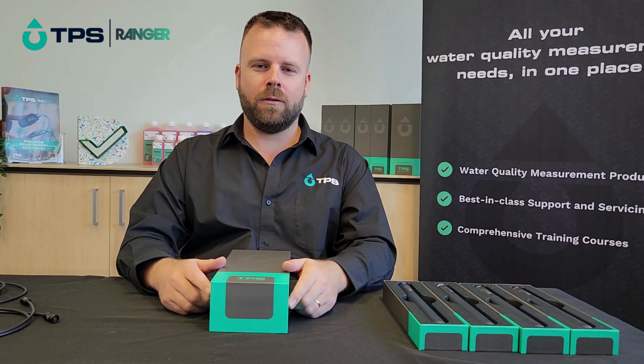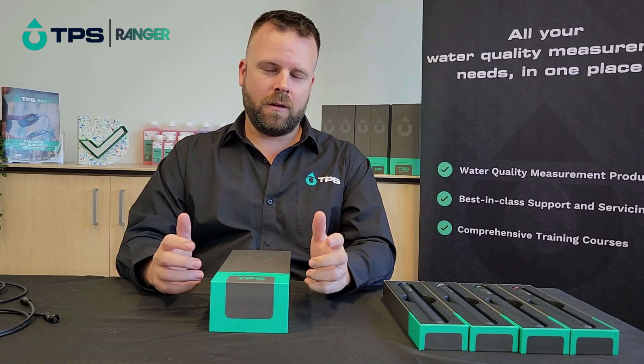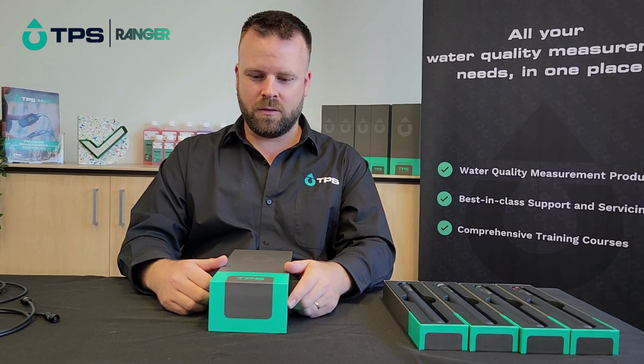G'day and congratulations on your new TPS Ranger. My name's Ben and in this video I'm just going to give you a short guide to get you set up and started quickly with the instrument.